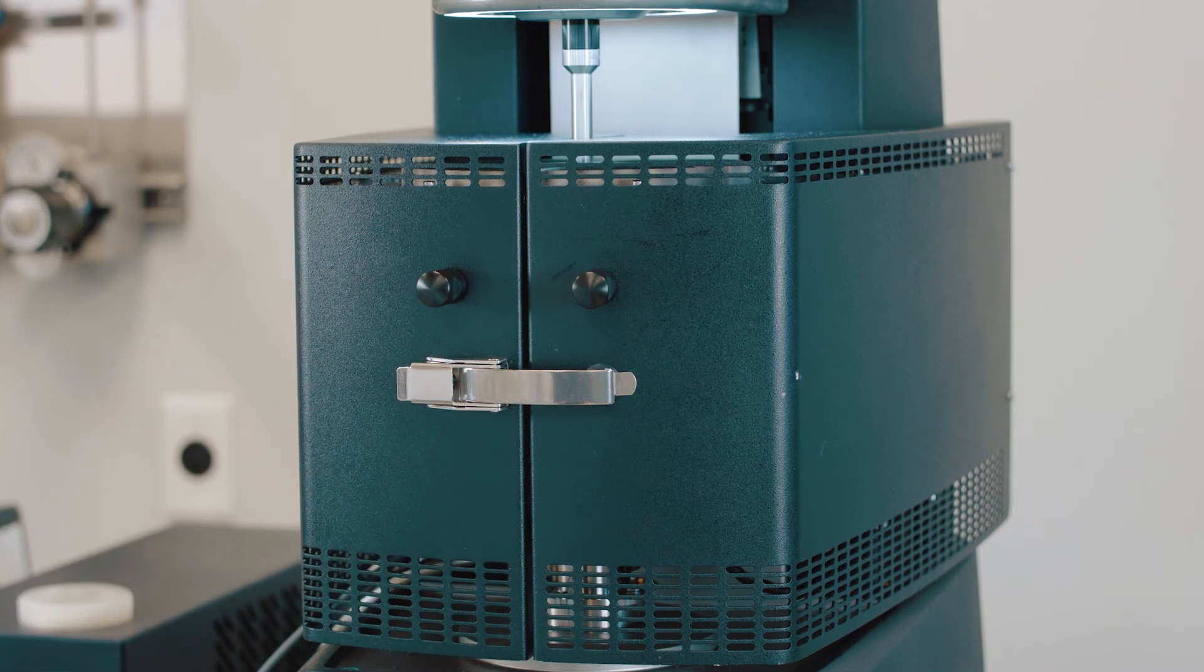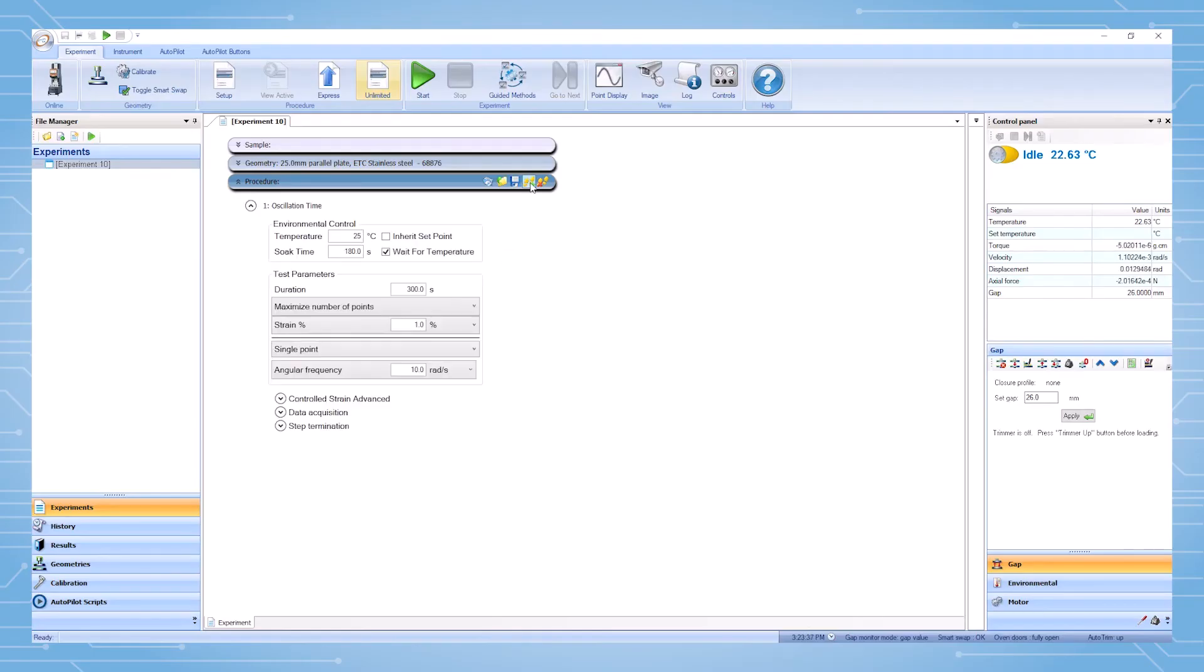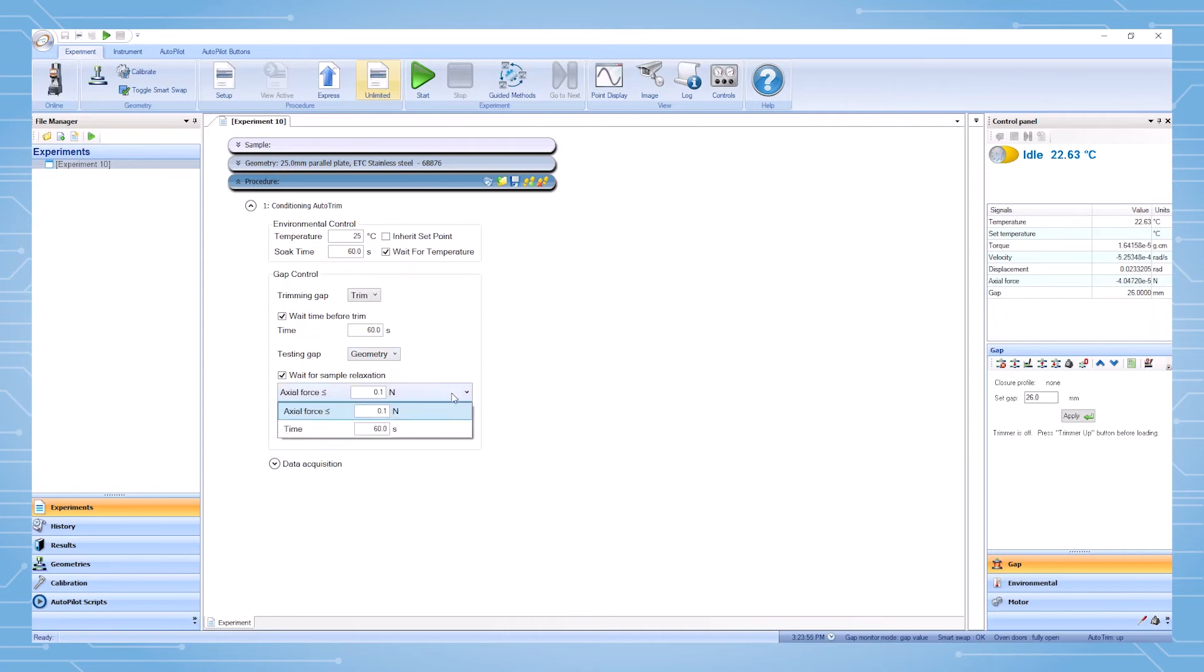The Auto Trim Step is programmed in TRIOS by inserting a Conditioning Auto Trim Step. Here the user can control the temperature, trimming gap, wait time, testing gap, and sample relaxation condition. Identify that the trimmer moves up after the test and that the motor lock be enabled.